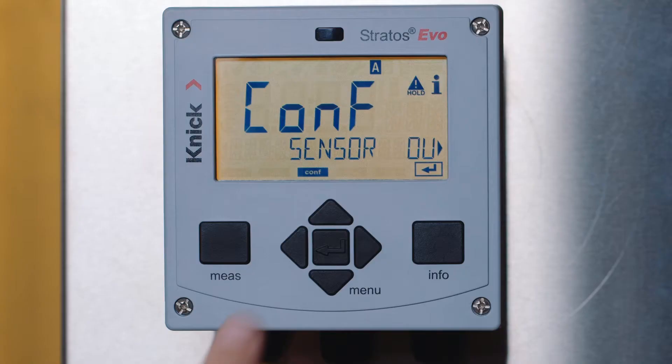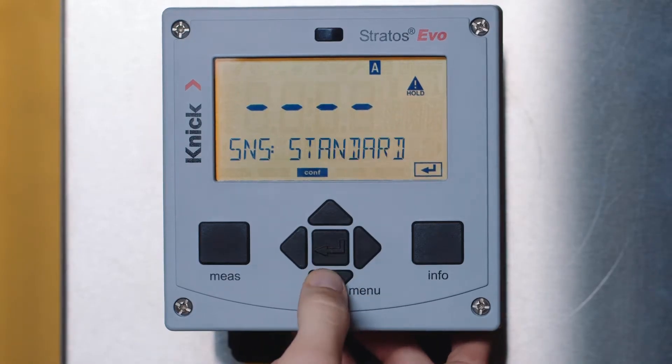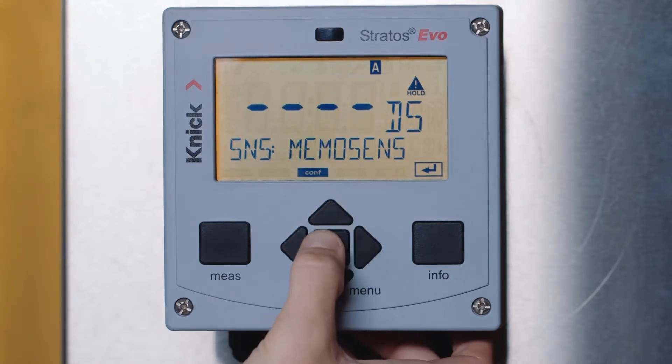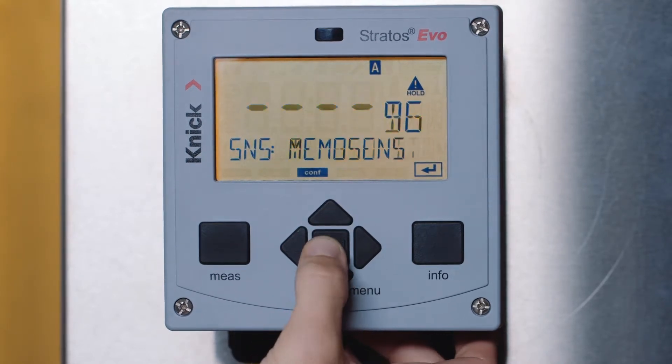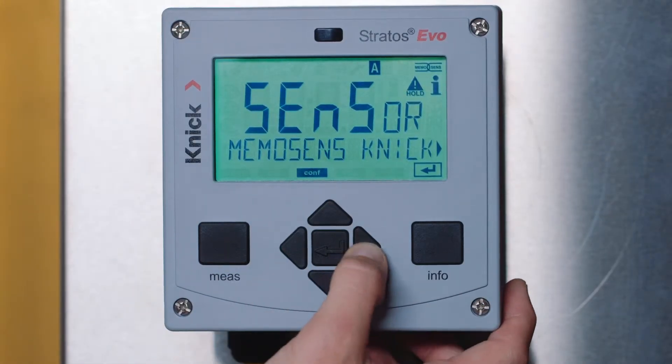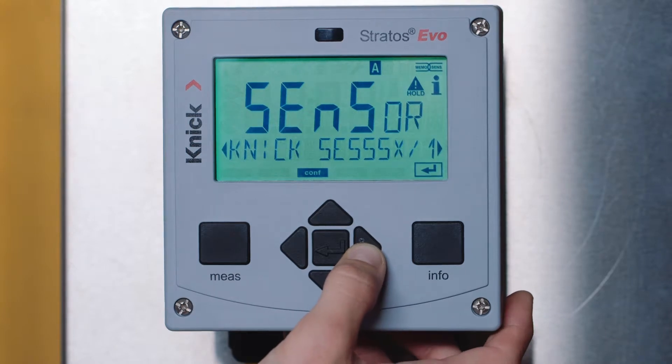Next, press enter to select sensor. In this menu, you will choose the type of sensor that is connected. We will select MemoSense and press enter. You will see that when a MemoSense sensor is connected, it identifies the sensor and gives the make and model.